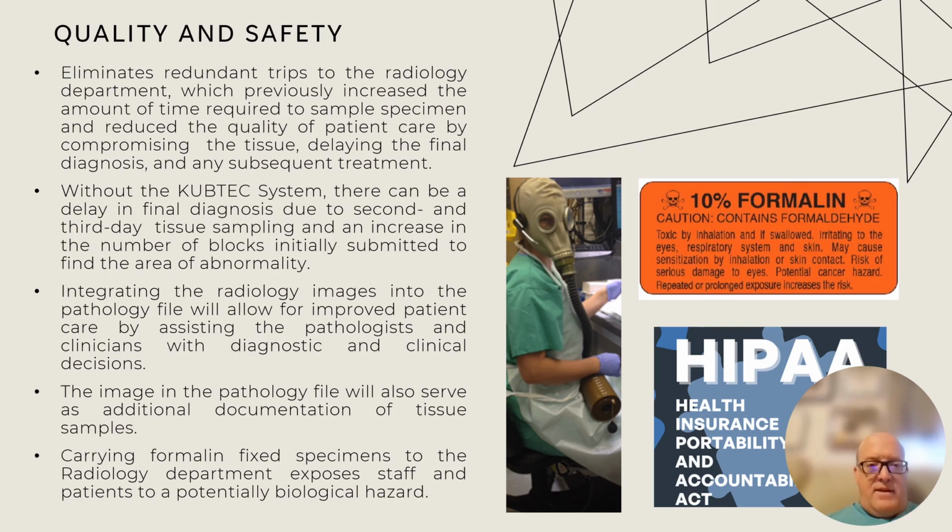Quality and safety. So many years ago, we would take our breast specimens and walk them down to radiology under a chuck. Of course, these specimens were saturated with formalin. We had to bring a sticker with the patient information on it. While it's all covered up, you have to think about safety, as far as the fumes. There are patients in the hallways watching us bring these specimens down the hall, and there have been times where you could possibly drop the specimen.